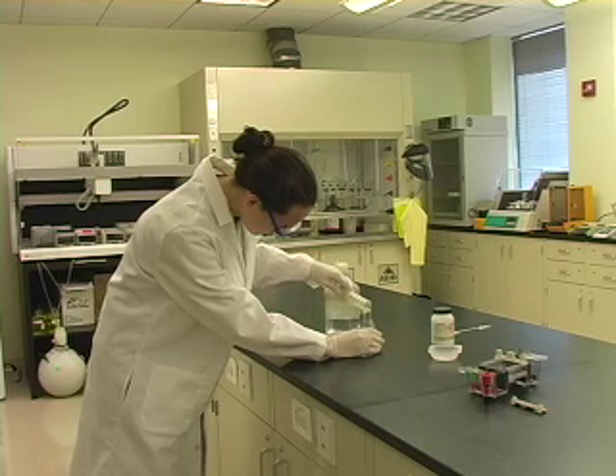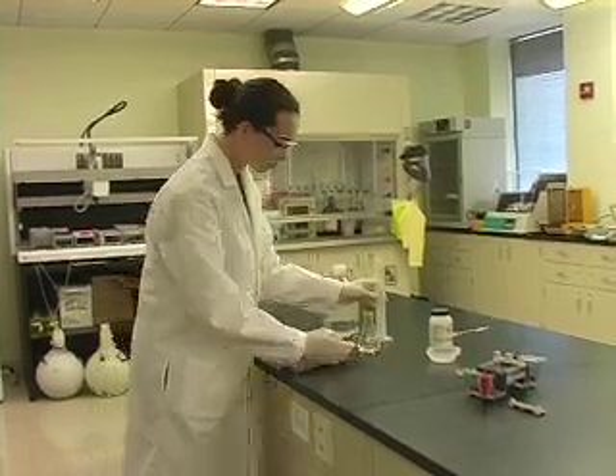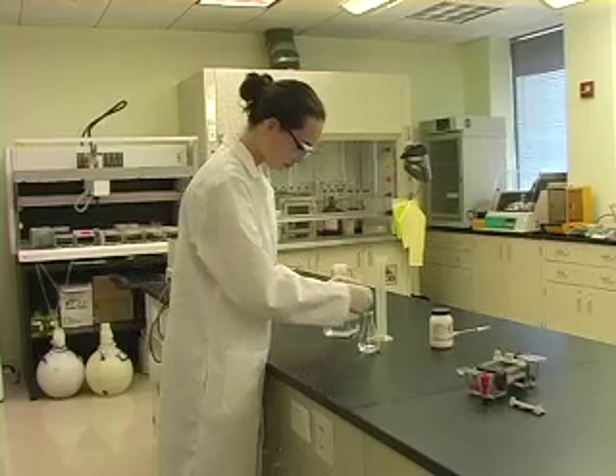Pour the buffer into a microwave-safe flask. Add the agarose to the buffer, and tap the bottom of the flask to make sure all the agarose gets into the flask.